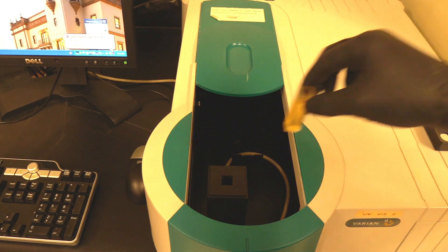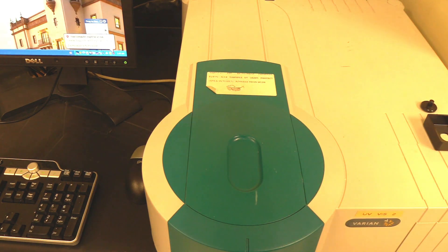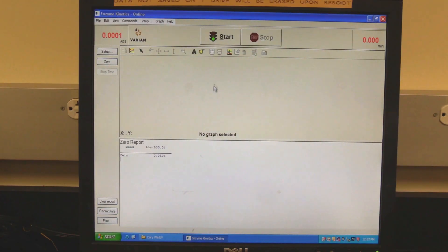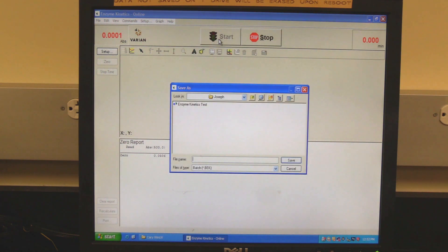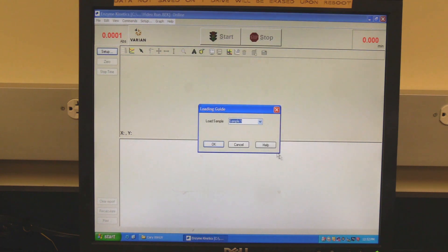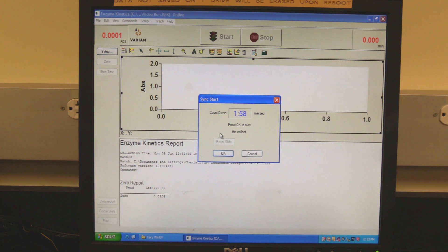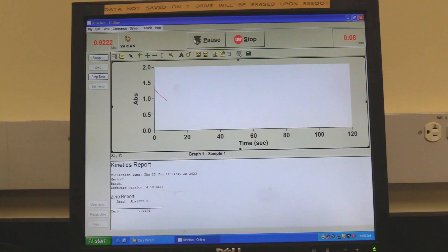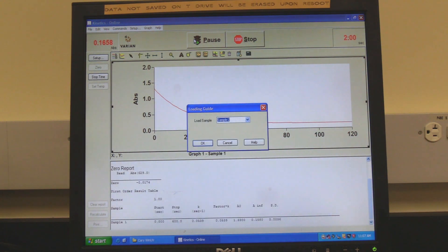Insert the sample cuvette in the sample chamber, as demonstrated in Wavelength Scan measurement. Click on the Start button. If Save at Start was selected, then the software will prompt the operator to save, as shown in the video. Find the appropriate folder, name the file, and click on Save. The software will prompt for the sample name. Click OK. The countdown timer will appear. Add the reaction reagents to the cuvette in the sample chamber and click OK. Wait for the measurement to finish. The spectrum will appear. The software will prompt for the next sample name. If measuring another sample, click on OK. The report area will have the calculated data.